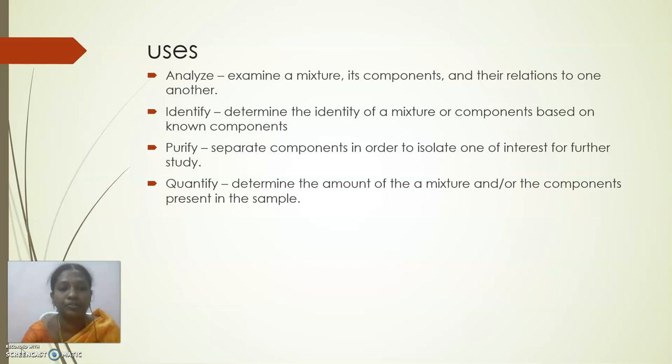Then next is purification. After the separation of the components, we can go for the isolation of the components, that is, the purification of the components, and chromatography plays an important role as the first step in purification of the sample. Then the last one is quantify. It helps to determine how much amount is present in the sample. For each sample component, how much of it is present, we can calculate by using chromatography.